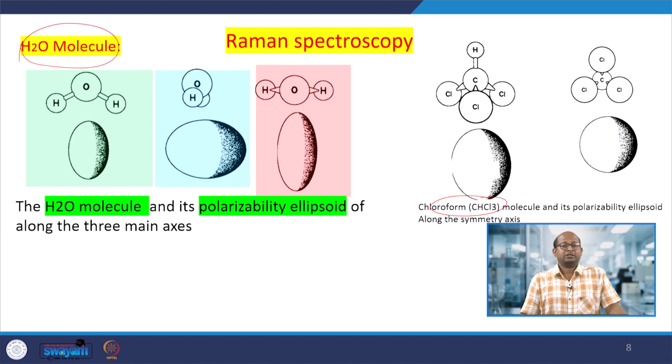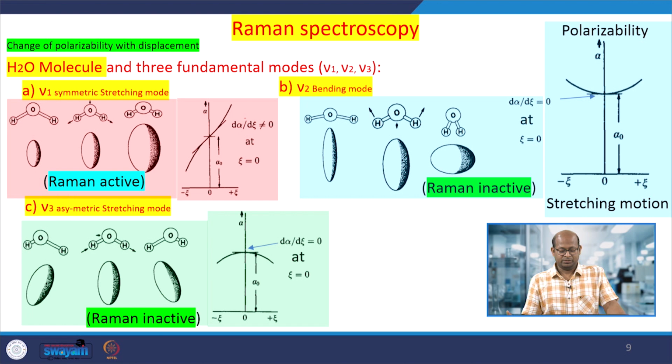When these are placed in an electric field, there is a change in the polarizability of the molecule. This happens in the water molecule and in other molecules of this type as well, when placed in an electric field. Two poles would be there, and electrons would move towards the positive and negative poles. By that way the change is induced, not very strong. So induced dipole changes would be there in the molecule.